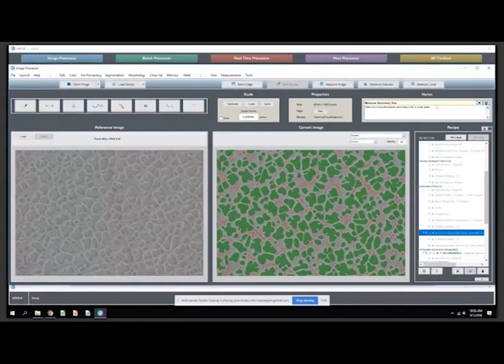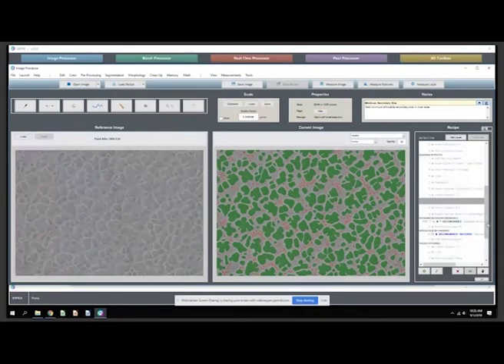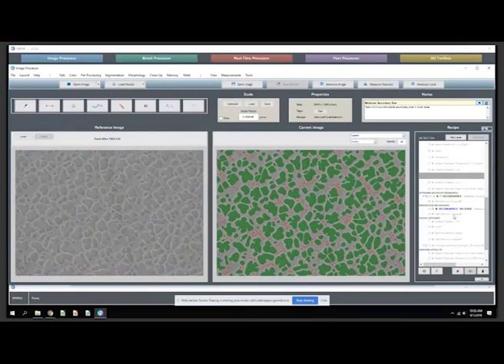And when you're in notes mode, you can type in custom tips for your users as to what this step does and what they might need to adjust. And those notes are available inside of simple mode too. Down here is where we optimize the boundaries. Here we remove edge secondaries to set up the secondaries layer. All of this, again, is built graphically with no coding at all.